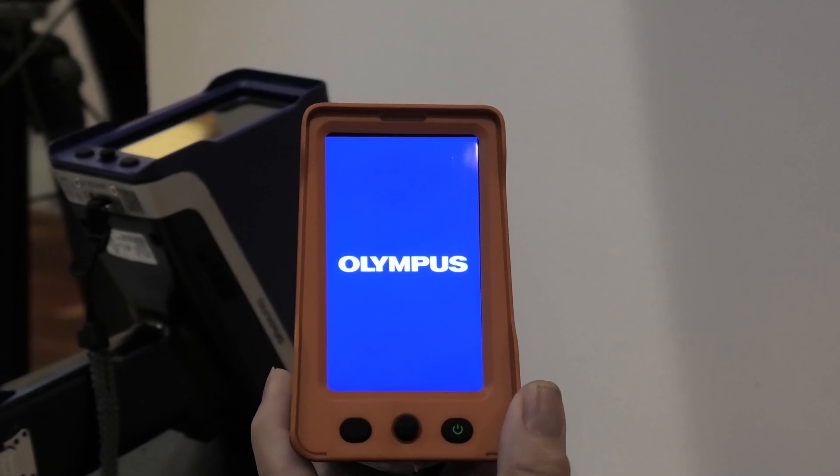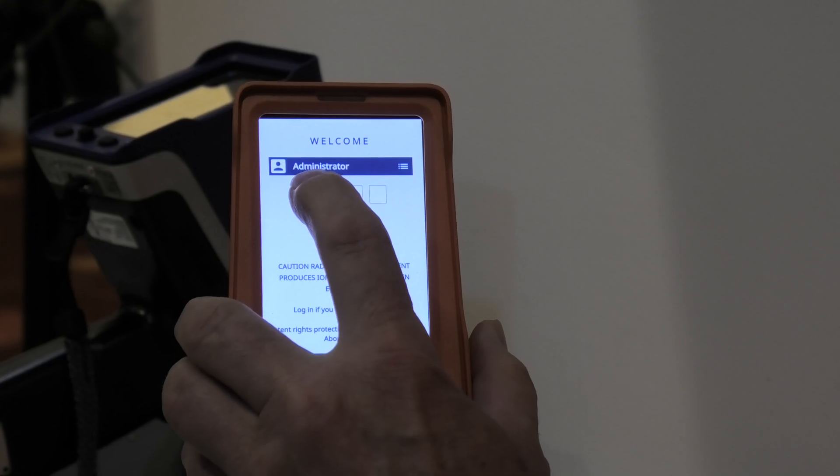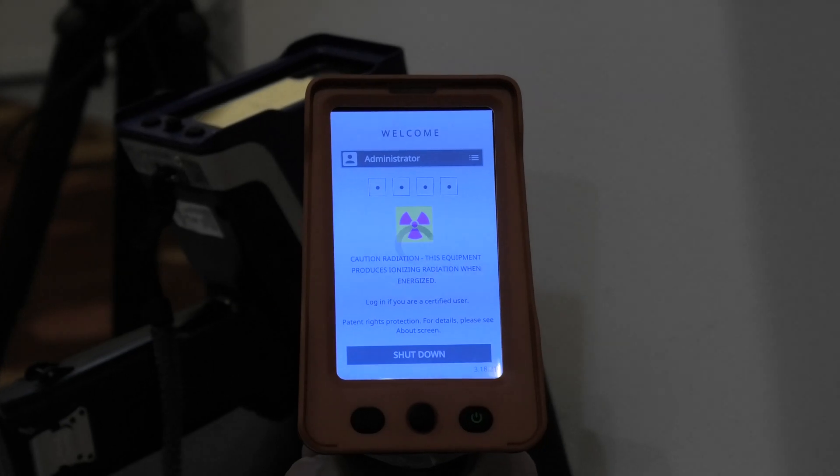We can't use the instrument straight away — we need to enter a code. That code will be provided to you by Tech Rentals. To enter the code, we just simply tap on the buttons. In this case we have a dummy code, but you'll need the correct code.